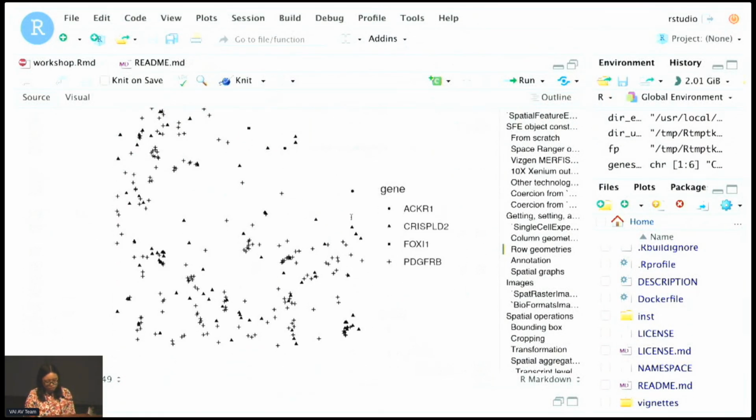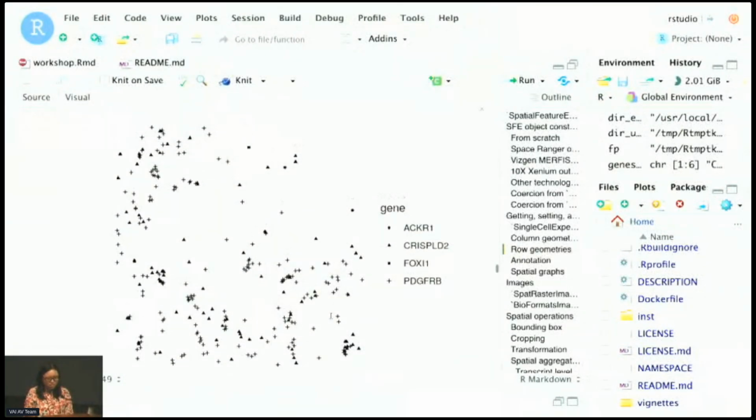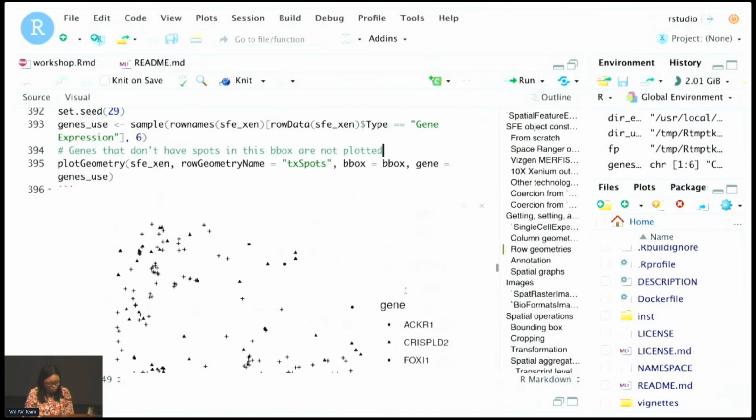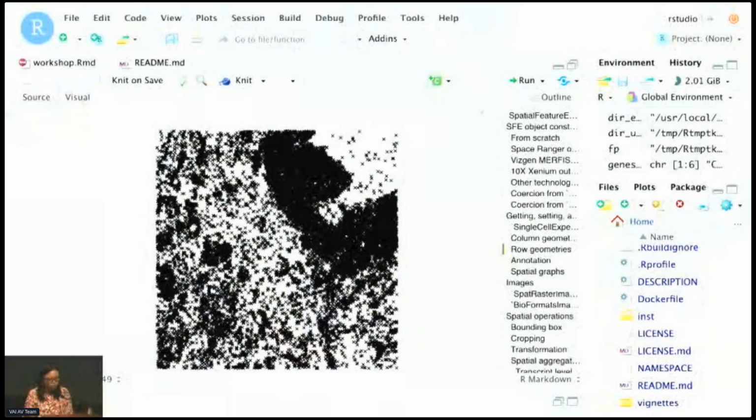So here the different genes are distinguished by point shape. That's because if you want to plot cell level data, we use color. In order to make the plotting functions colorblind friendly, if I use different palettes, it's less likely to be colorblind friendly. So here I use point shapes, which means we can only plot a small number of genes at a time. But when we plot too many genes, you get overplotting anyway.